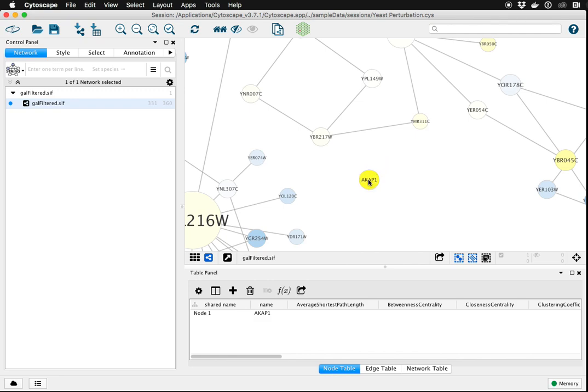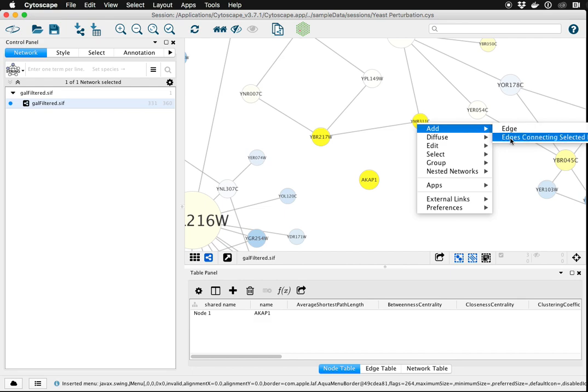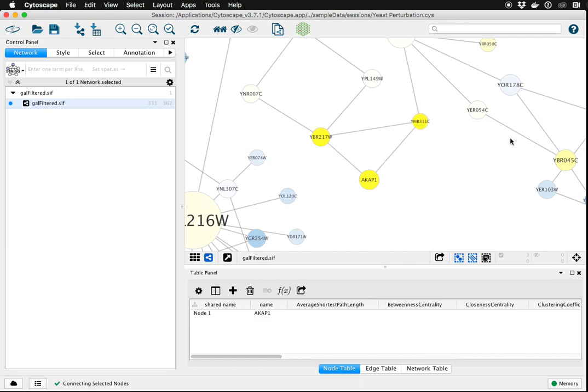If you want to add more than one edge between a group of nodes, you can select multiple nodes. Right-click and say Add Edges Connecting Selected Nodes, and that'll add all the edges at once.